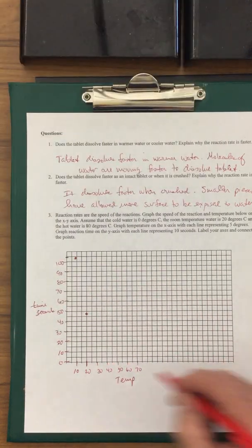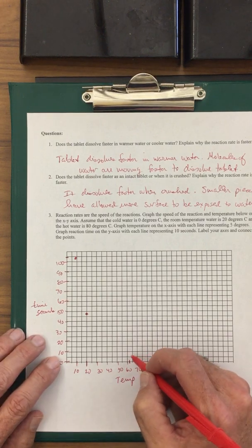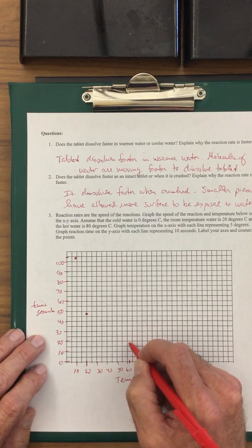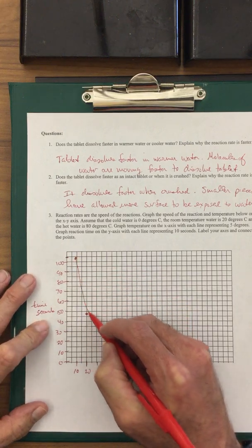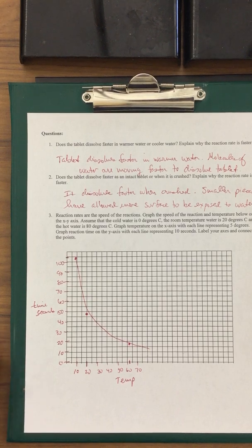Hot water at 62 was at 18 seconds. So right about there. This is interesting. This may not be a linear relationship. This could be what's called an inverse relationship. So it's looking more like that rather than a straight line.